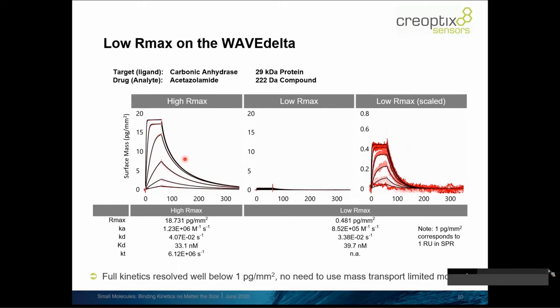However, if we decrease the density and we go to the middle and to the right-hand side here, we see actually that if we leave the scale as it is, we barely see anything, and the response, of course, gets proportionally smaller here. However, for your experiments and for some biophysical reasons, mainly related to mass transport, you might actually want, and it might be desired for you to go to low densities to, for example, avoid mass transport and diffusion effects for your systems.